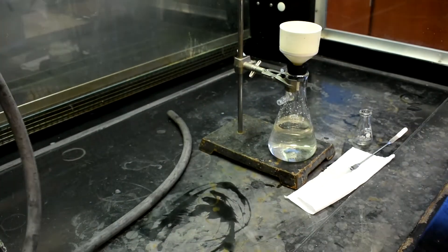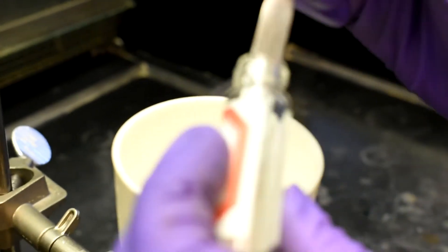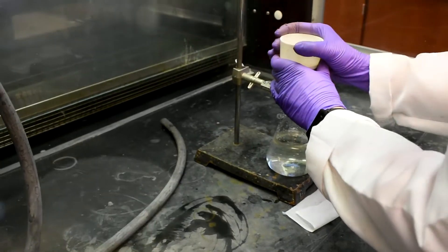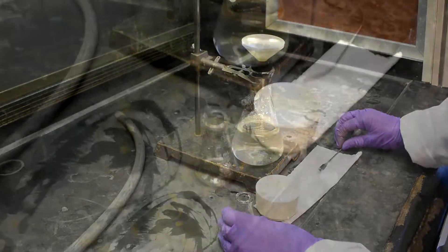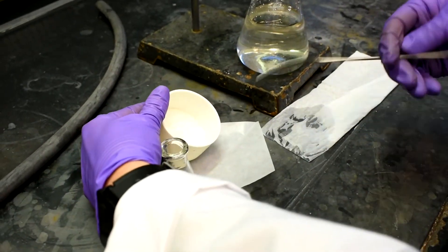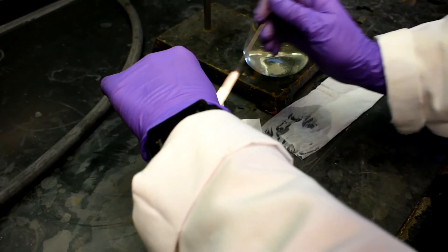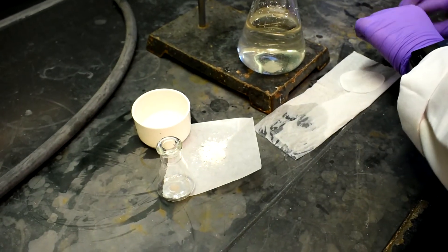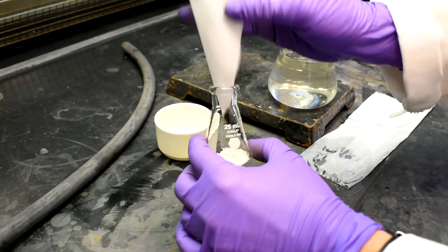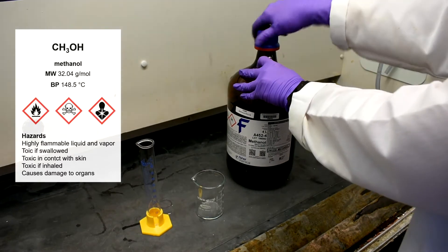Remove the vacuum trap prior to turning off the vacuum. Reserve about 5mg of the crude product in a vial for TLC analysis. Next, a recrystallization will be performed to further purify our product. Transfer the product from the filter paper to a 25ml Erlenmeyer flask, making sure to get as much of the solid from the filter paper as you can.